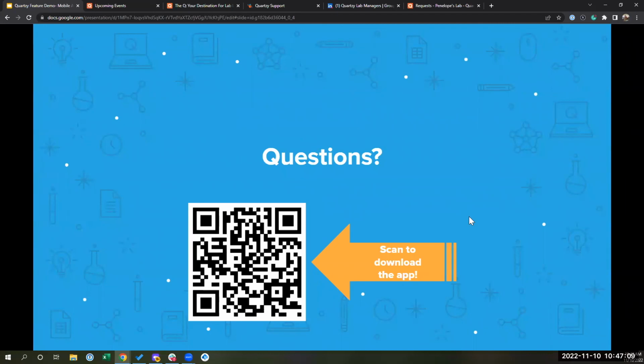That's totally fine. In this case, we're calling it packing slip upload because that's what's relevant in this mobile flow. But in reality, you can attach any type of file you would like, and it'll get associated with the request that you're linking it to. So totally possible. We've had customers for years that have used the scanner, and then they bulk import them into Quartzy or some flow like that. And so we're trying to solve that with the packing slip photo attachment. But yeah, it works either way.